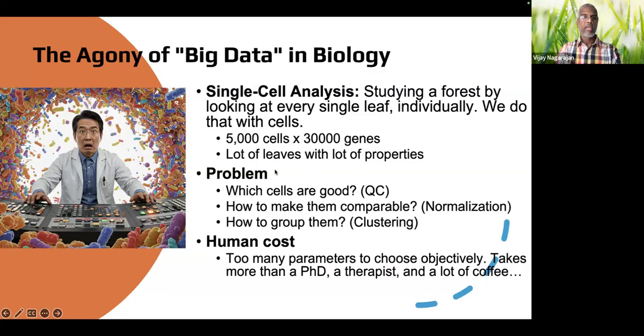It's too much data. You can look at the data in so many different aspects. Every cell is going to be unique. There are not going to be two cells that are identical, right? Because they are technical replicates, or you can even call them biological replicates. One cell and the other cell is a biological replicate. You're going to have a lot of variations. So you could study those from so many different angles, asking so many different questions, and exploring them from lots of different perspectives, using lots of nice, cool concepts in big data analysis.